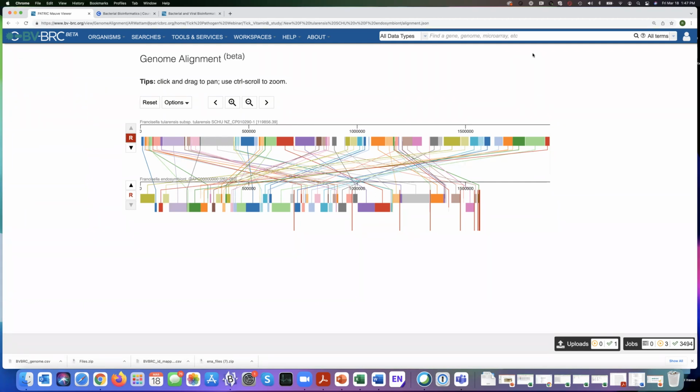Yeah, one more question here. So this app can be used to use the contigs alignment, right? Again, it's the reference genome. But suppose we have a segmented genome, like influenza, what kind of reference can we use here in case I want to use this one? Malik, is genome alignment working on that?